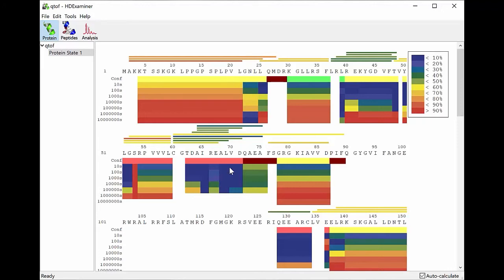Well, as you may know, to generate a heat map from HDX data, you first need to use your peptide coverage to break your protein up into resolvable chunks. And then what you do is you solve a least squares problem to find the deuterium occupancy on each of those chunks that best matches your measured peptides.